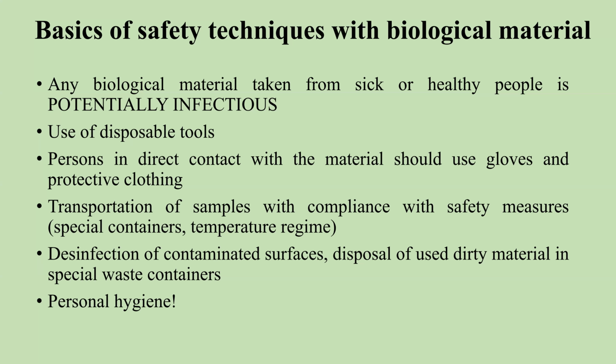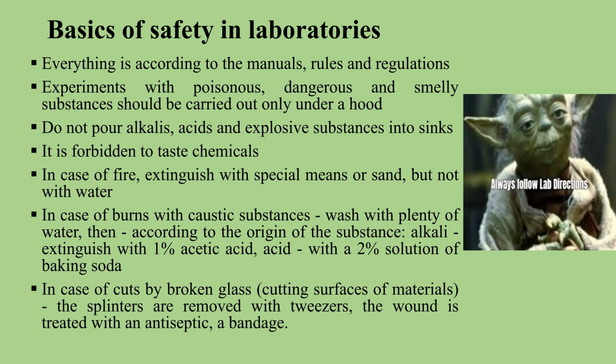We should follow these safety protocols, use disposable tools, gloves, glasses, check the transportation of these samples, and check compliance with safety measures and personal hygiene.